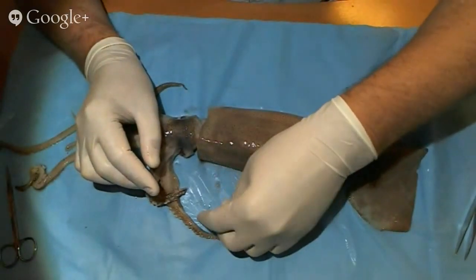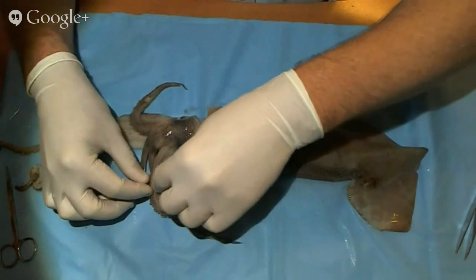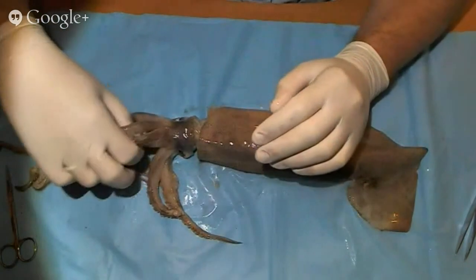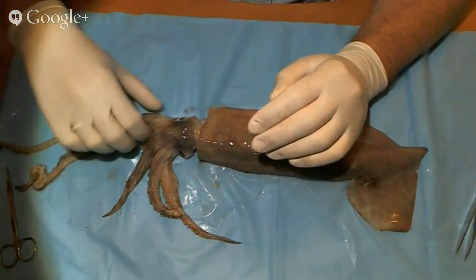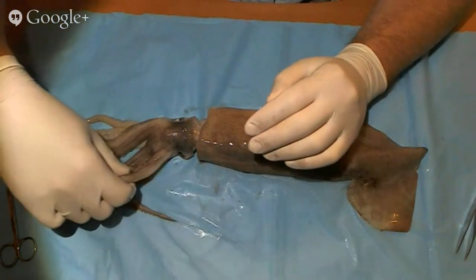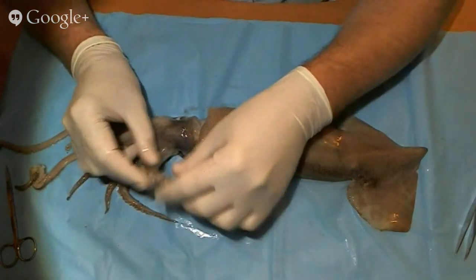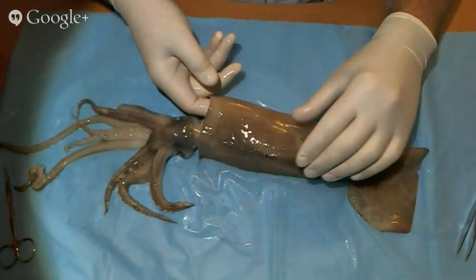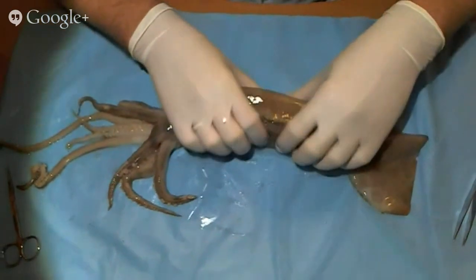And that might get kids to remember that, oh yeah, I've seen on sperm whale that they'll have giant sucker marks on them because their main food is the squid, and the squid will fight against it, obviously. And when they do so, they'll put giant sucker marks that scratch on the squid. Okay, so we've got how it moves. And how it breathes, we're going to get to when we get inside of there.